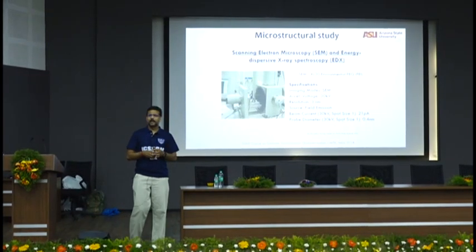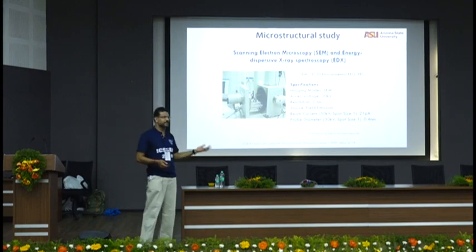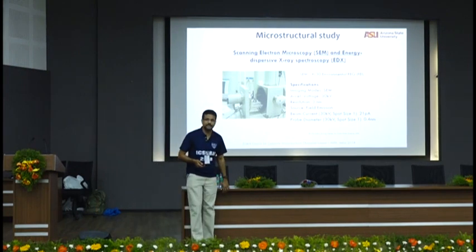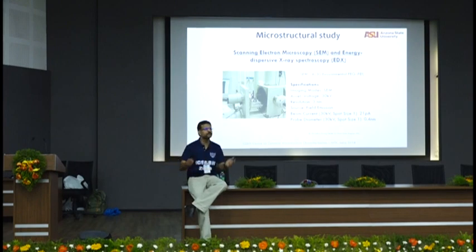You have tabletop ones, you have the big ones, you have the field emission microscope, which one of these is. You have the environmental SEM, where you don't have to dry the sample. You have the low vacuum, you have the high vacuum, you have all those different categories. So choosing what SEM to try is not that big of a deal in cement-based materials, because pretty much all SEMs can work for you.